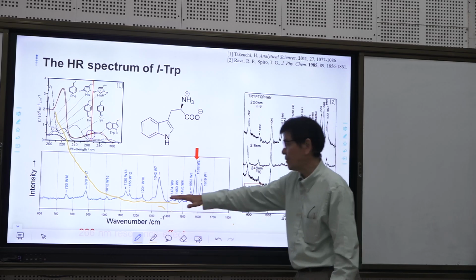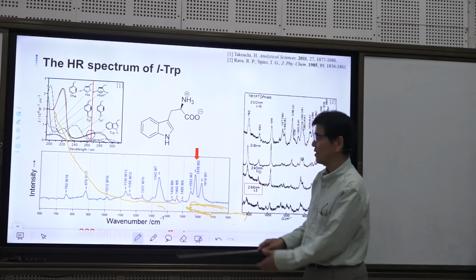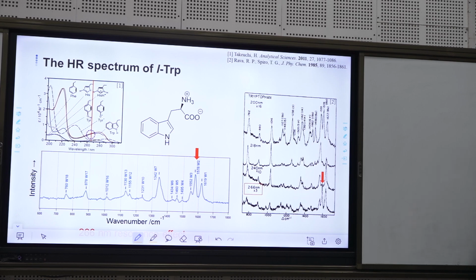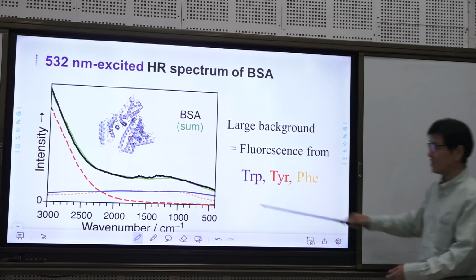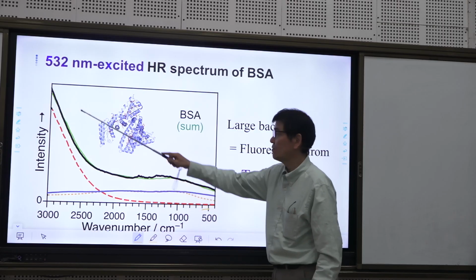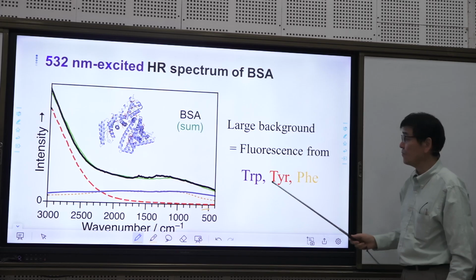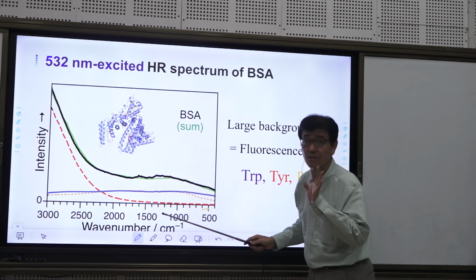Honestly speaking, a much larger two-photon baseline is simultaneously detected in this measurement. But anyway, the tryptophan signal is here, and it appears with the two-photon fluorescence like this, and by adding these three curves, we can roughly explain this curve in terms of the two-photon fluorescence of the aromatic side chains. So we can safely subtract this curve as a baseline, because we already know the origin.